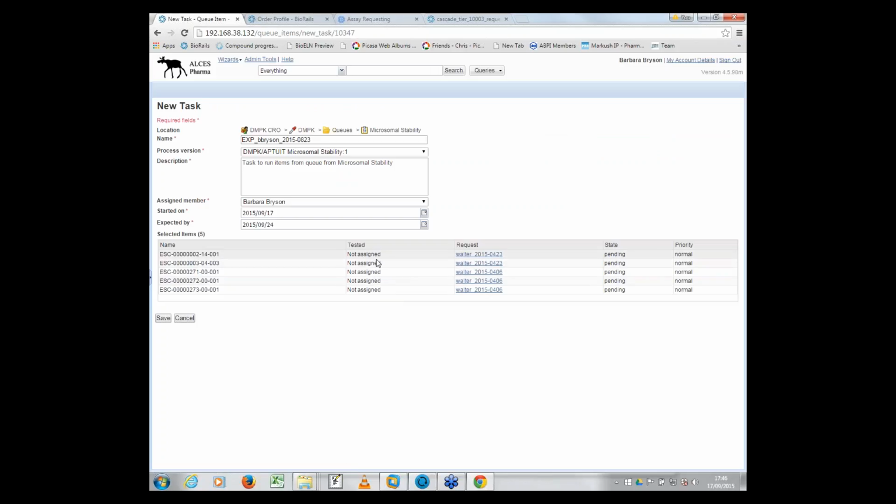What I'm going to do here is I've actually got too much work to handle for my internal DMPK team. So I can outsource this one to various different CROs, or I can run it internally with my teams. If I'm running it internally, I'll run this microsome stability results workflow, which not only includes the details of the assay, but also a template for actually doing the data analysis as well. Or I could externalize it to a CRO.